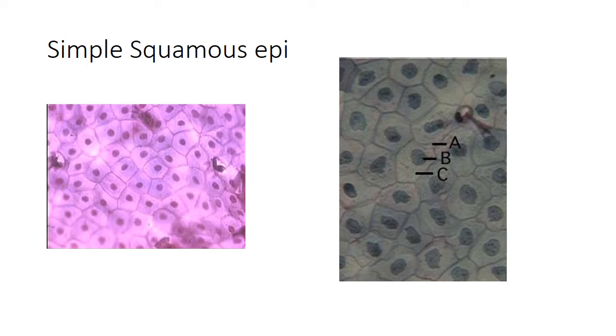Are you ready? So simple squamous. These are the pictures I'm going to use. I'm not going to pull some picture off the internet, and you have no idea what in the world it is. So just review these, man, you'll be golden.